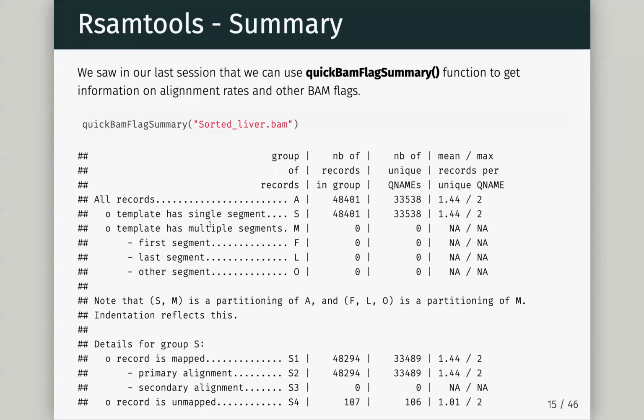So we saw in our last session, we can use this quickBamFlagSummary. Okay, I'm not sure if anyone actually tried running that. So quickBamFlagSummary is slow. Okay, just by the name, quickBam, it's actually pretty slow, and it's going to go through your reads, one read at a time.